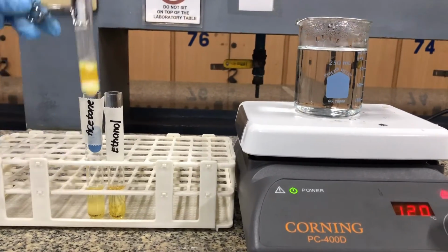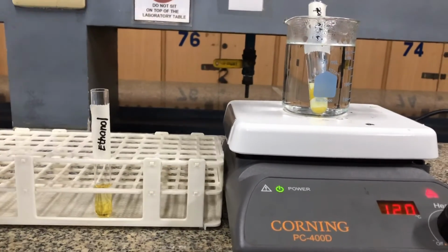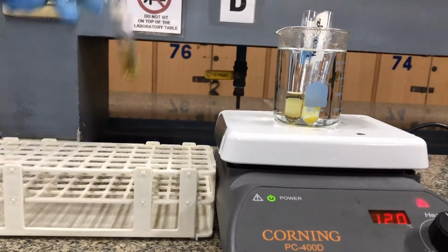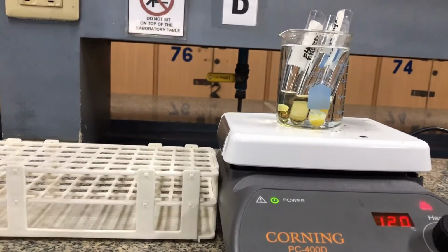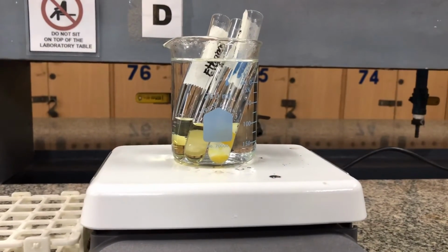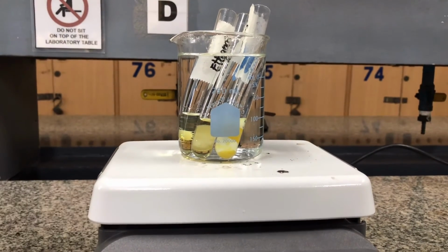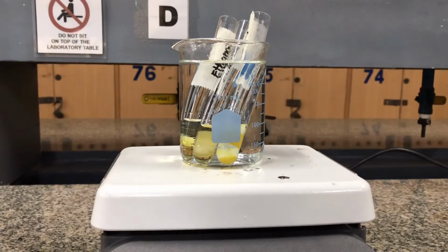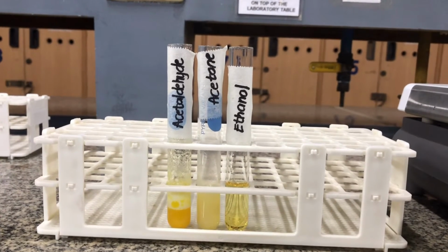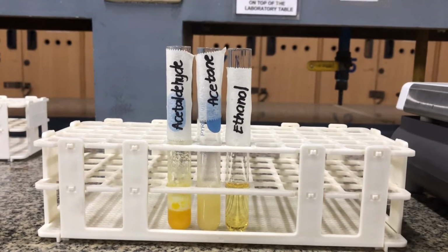Then, the test tubes containing the mixtures were heated in a boiling water bath for 5 minutes. While heating in the water bath, yellow precipitates were starting to form in some of the test tubes. After heating, the results show that only acetaldehyde and acetone were able to form yellow precipitate, while ethanol did not.